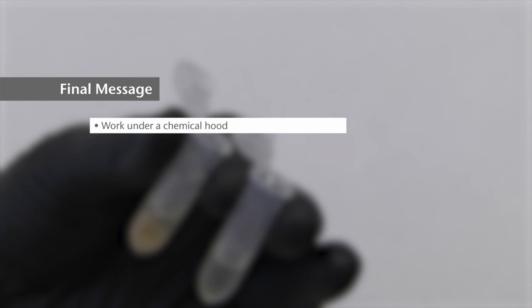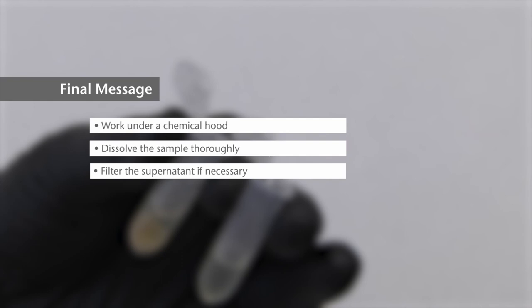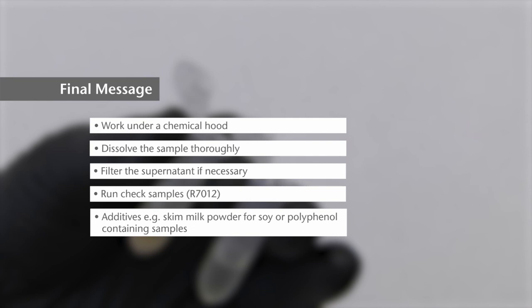Final message: It is recommended to work under a chemical hood. Sample should be dissolved after addition of cocktail patent and also after addition of 80% ethanol. Avoid any clumps. If the supernatant is not clear after centrifugation, filtrate the supernatant. It is recommended to also run check samples, for example R7012, with known concentrations for quality control.